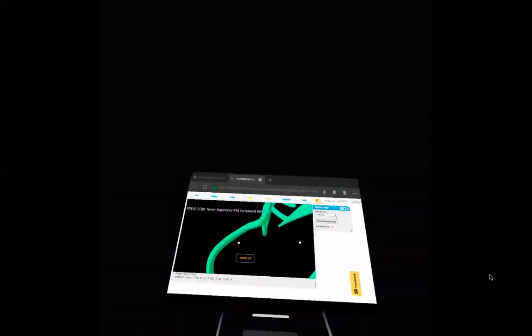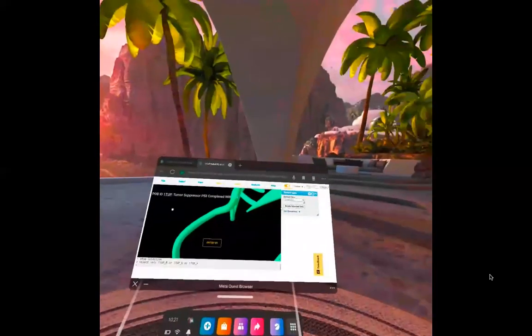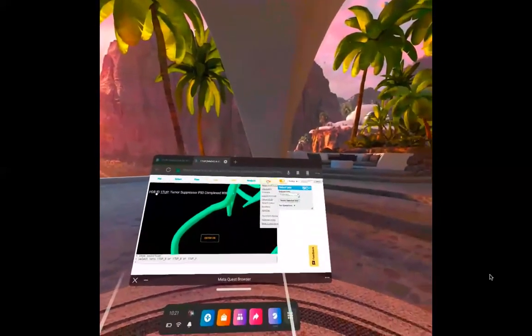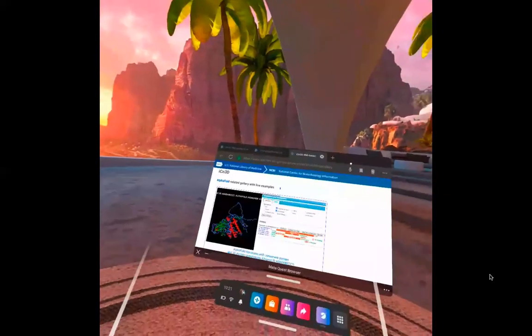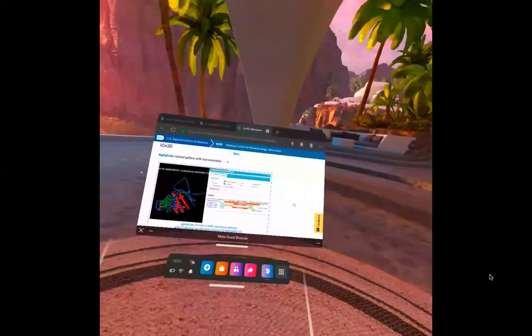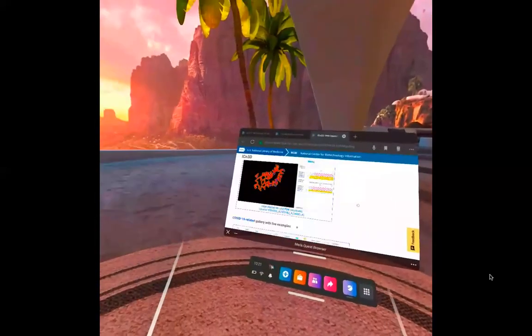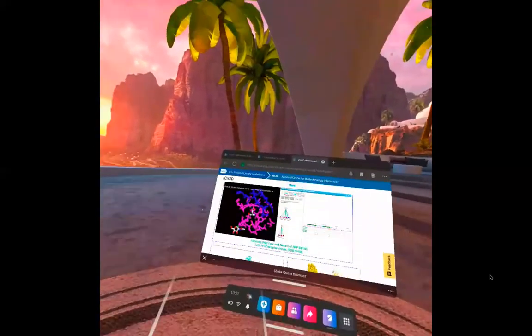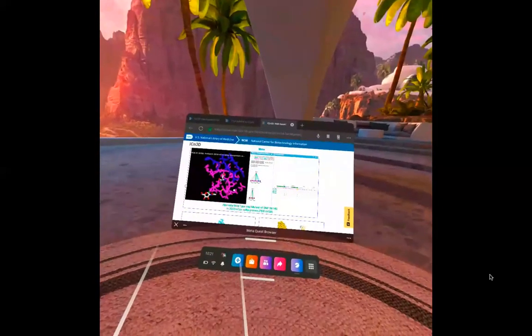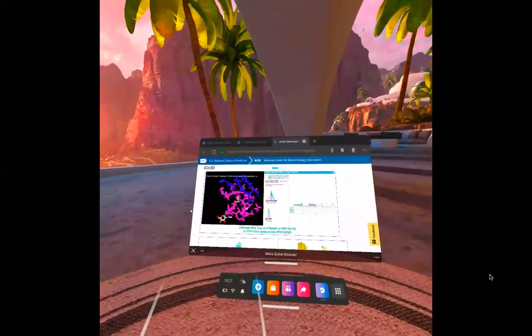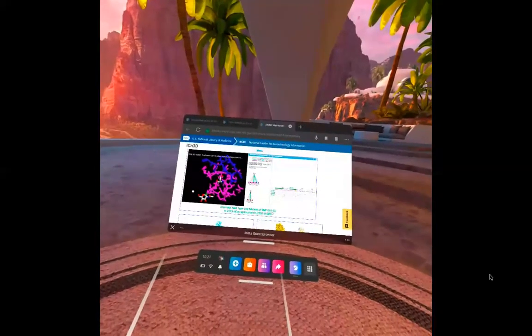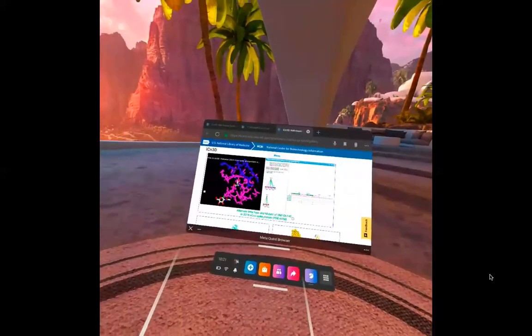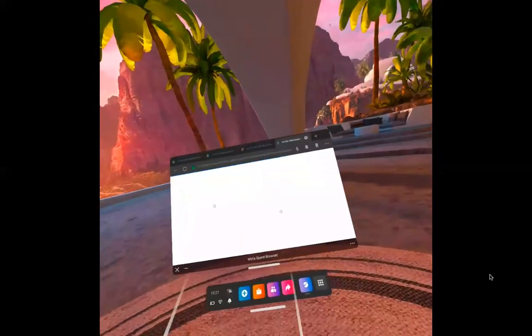One good thing about the iCN3D view in VR is you can go to any of your previous iCN3D view, your custom view. And for example, let's say you have the interaction site for the mutant of the D614G. So you open the iCN3D view.